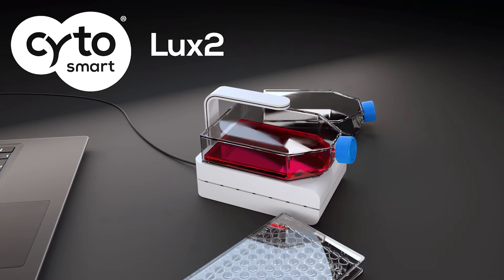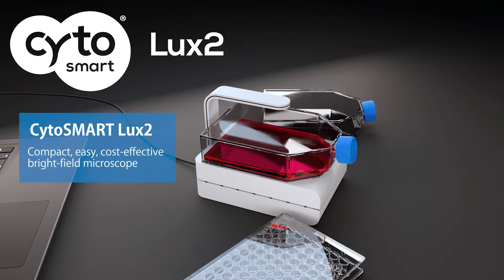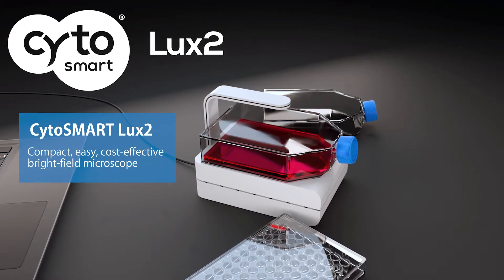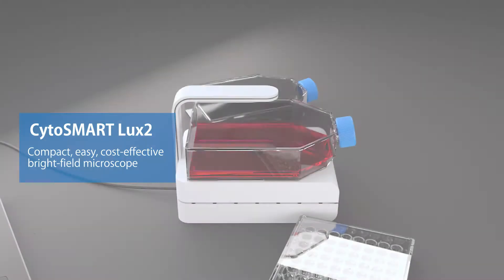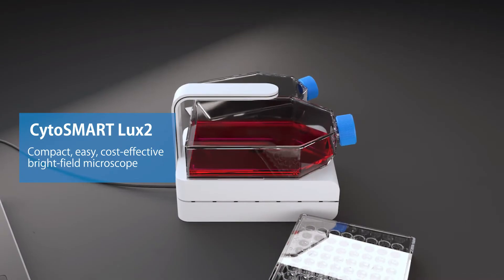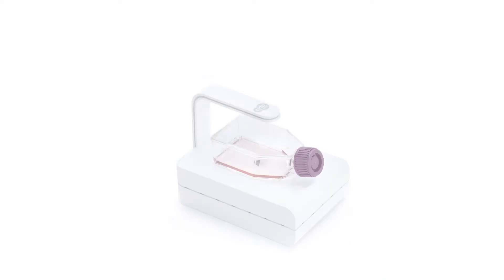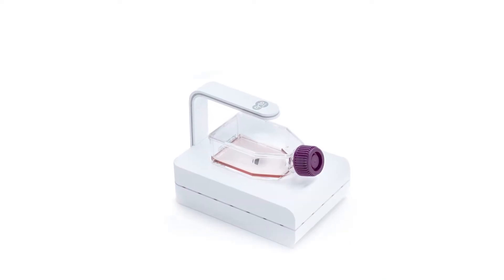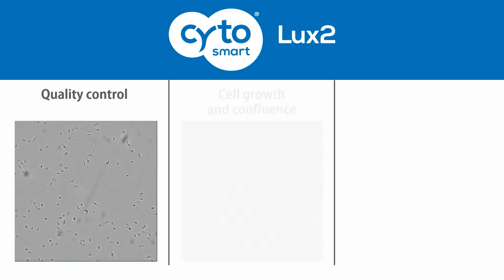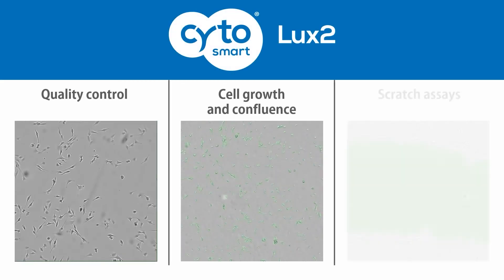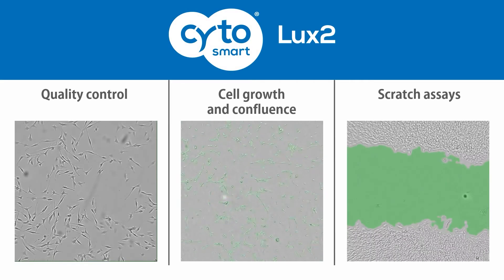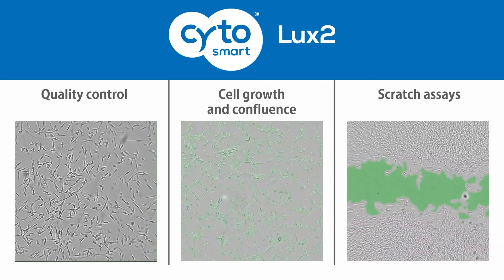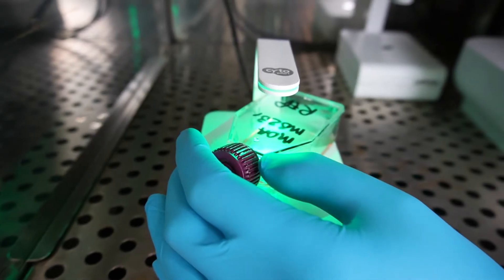The Cytosmart Lux2 is a compact, easy, and cost-effective brightfield microscope for live cell imaging inside your cell culture incubator. It's designed for cell culture quality control to monitor cell growth and confluence, to analyze collective cell migration and scratch assays, and more.